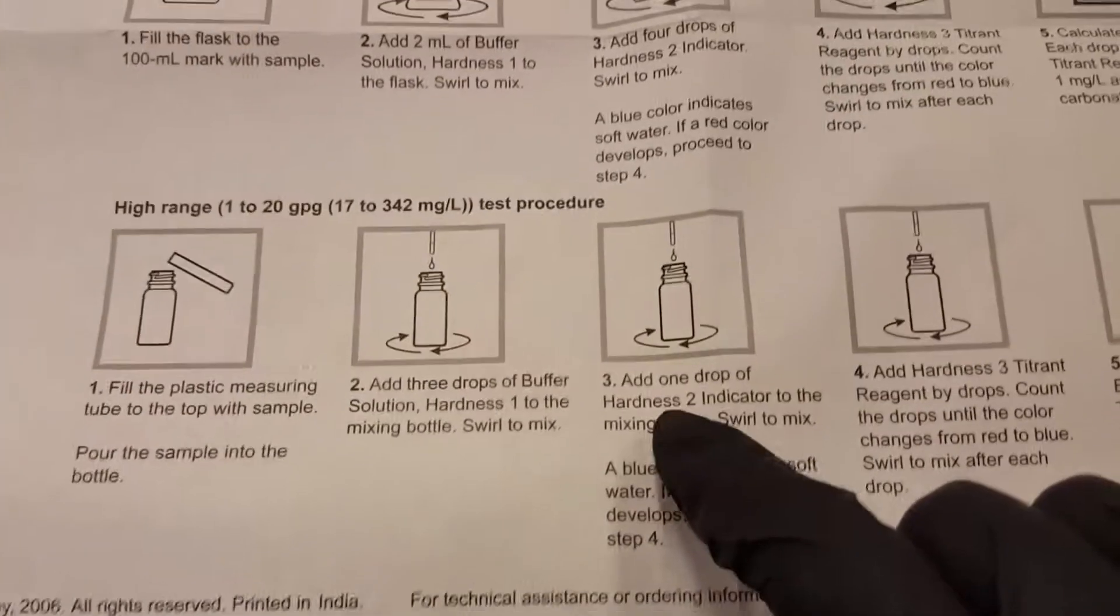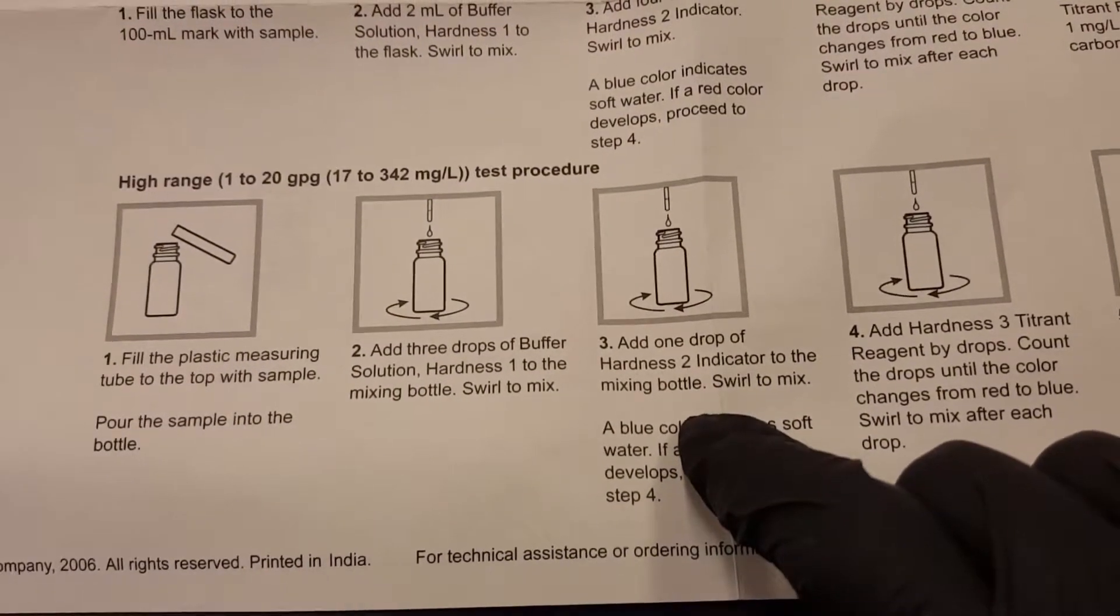Then step three says add one drop of hardness to indicator. Swirl to mix. That's this red stuff right here.